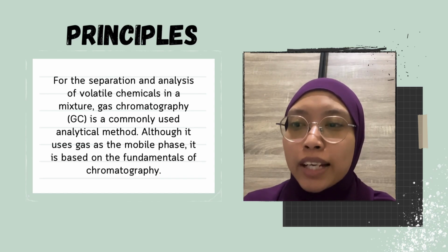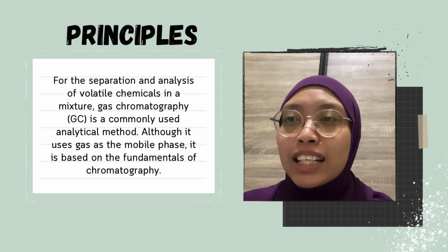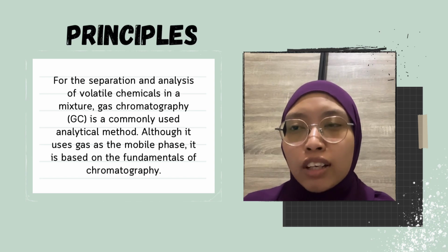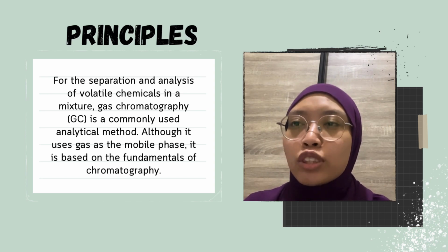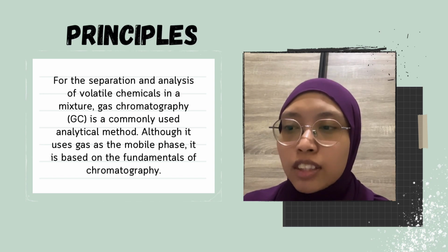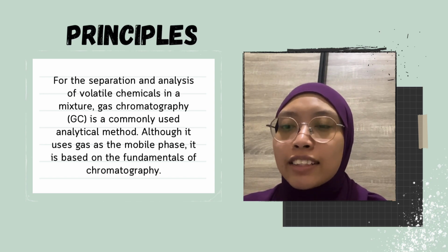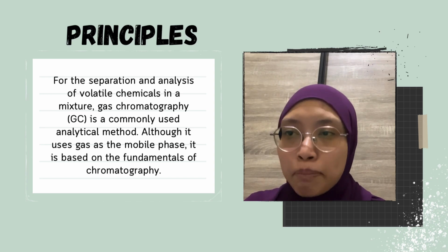Today I will explain about gas chromatography. What is chromatography? Chromatography is an analytical technique that is used to separate the chemical components of a sample mixture and then detect them to determine their presence or absence in the sample.